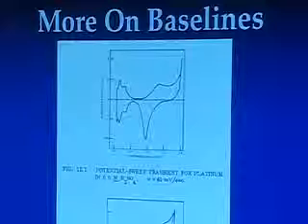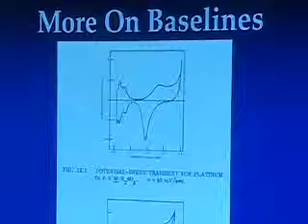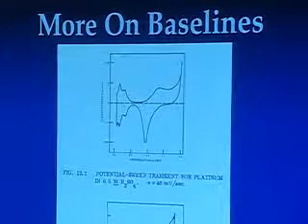Now, someone could get a cyclic voltammogram that looked like that when they've intentionally added some electroactive species in there and try and assign some of these peaks to some of the stuff they added to solution. They would be fooled. So it's very important to have a baseline before you add in your electroactive material.